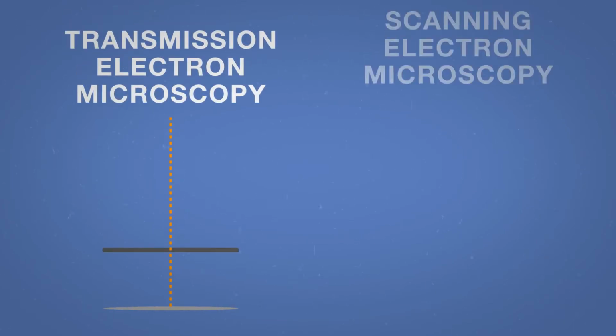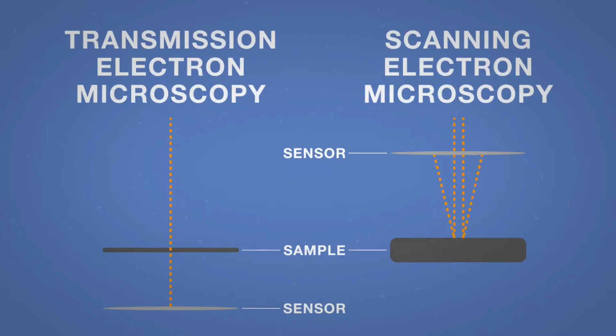Our research group focuses on developing and applying advanced electron microscopy methods for microstructural characterization and in particular defect analysis in materials of interest for a variety of technological applications. There are two major areas of electron microscopy: transmission electron microscopy and scanning electron microscopy. And TEM is very powerful for looking at defects. However, it requires a lot of destructive sample preparation, whereas SEM does not.